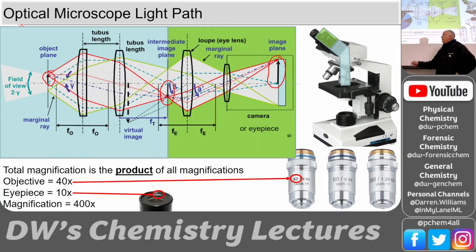So this 40, and then we might have an eyepiece. If you look on the top of the microscope, you'll see the magnification of the eyepiece, and that's a 10x eyepiece here. Then overall, it's a 400x magnification. So you've got to know the objective and the eyepiece. Many times you just pick the eyepiece, like a 10x eyepiece, and then you rotate this nose here and go from 40 to 60 to 100, and you can look at it that way.